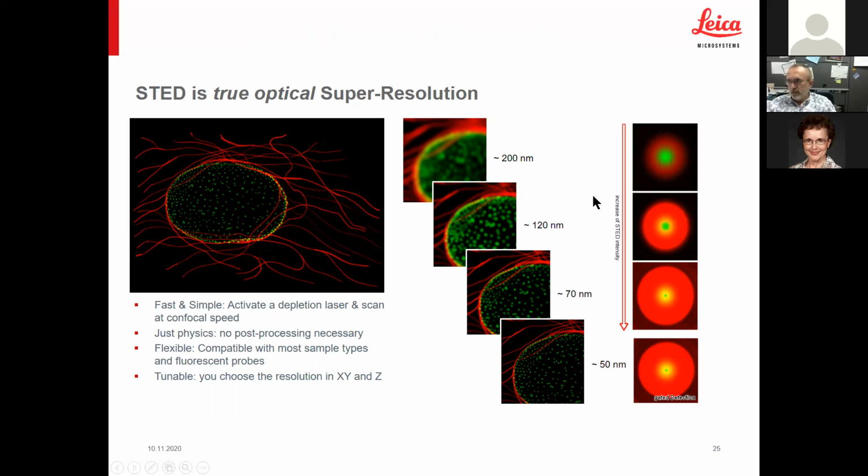But it's really nice. And if you come back next week, hopefully everything will work great, and I'll be able to show you that on these modern systems, you just click a couple buttons and you go from regular imaging to super resolution.